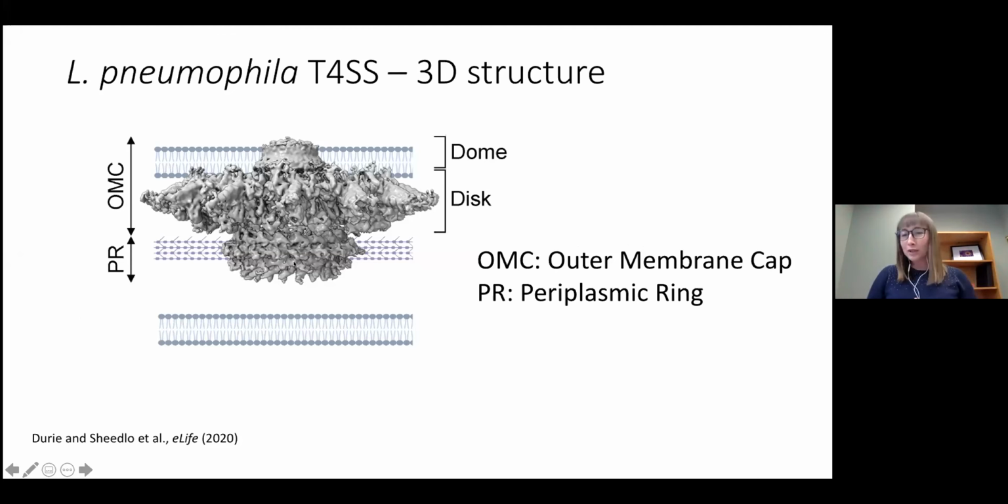So this is again very similar to what we saw with the H. pylori complex, but I'll talk about some differences as we go. So I'll use the full terms when I'm talking about these regions, but you might see PR and OMC in some of the figures that we look at.